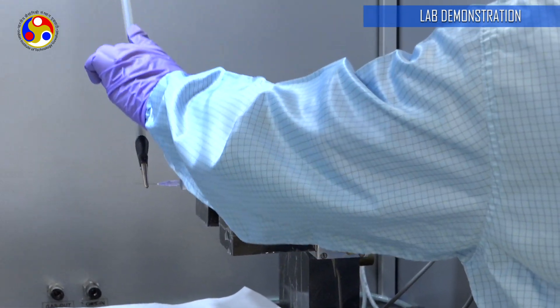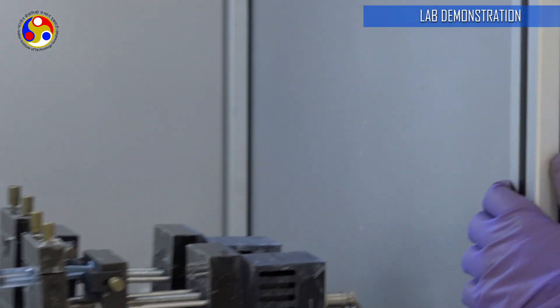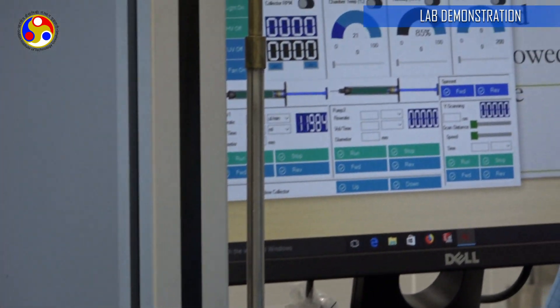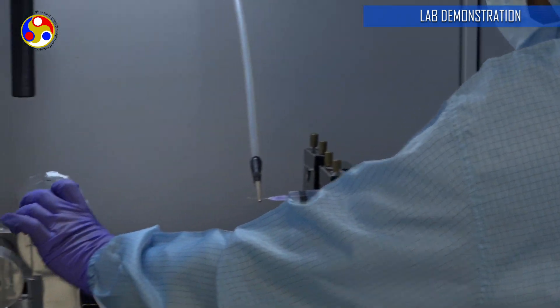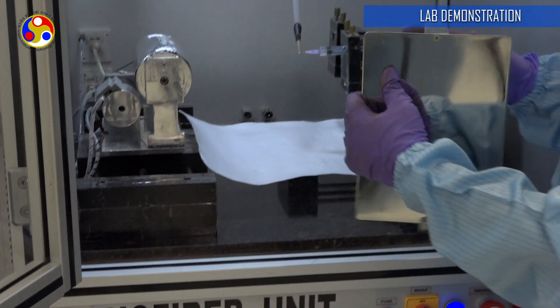I have not applied the high voltage yet, but I will get to that. I will just stop this for a minute. As you can see here, this collector is a rotating drum. We have another collector kind here.